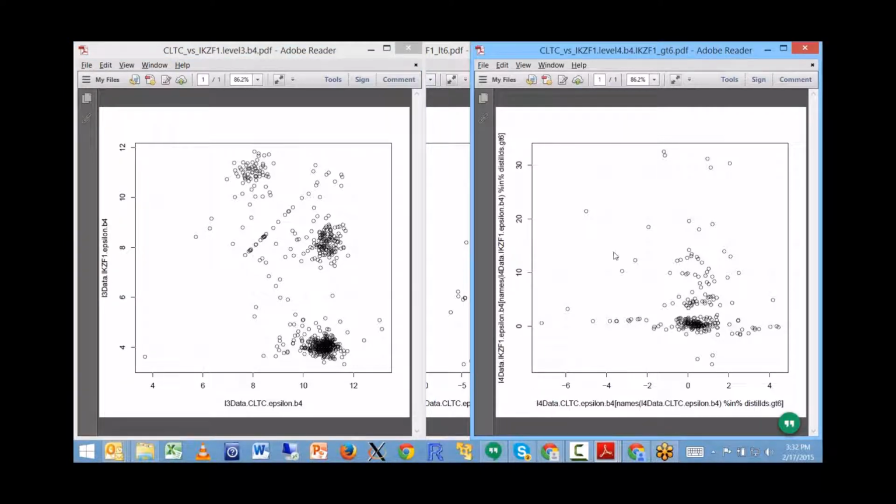And if you look at the level of deviations of these Z statistics, there is a clear group starting somewhere here around 3 or 4, and then going all the way to 30 in terms of positive Z statistics. So these would be really, really unusual observations. And it would basically correspond to deviation between what you see at this level of expression for this gene versus this level of expression for this gene.